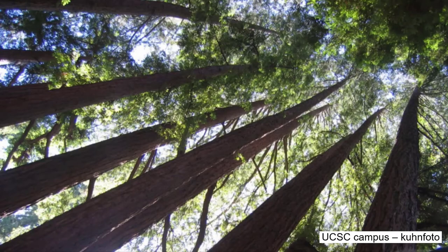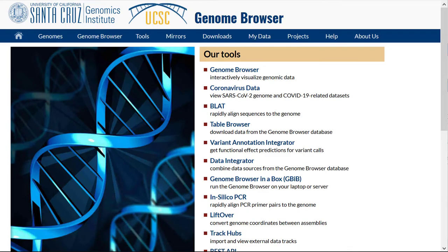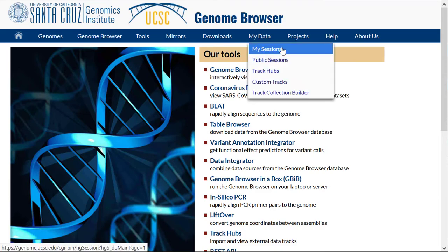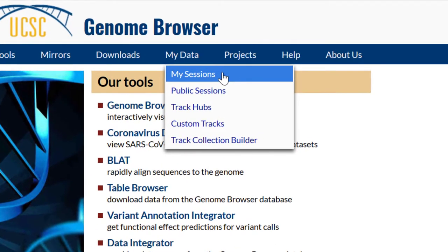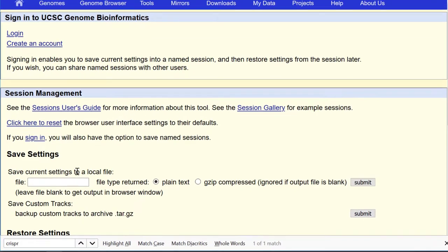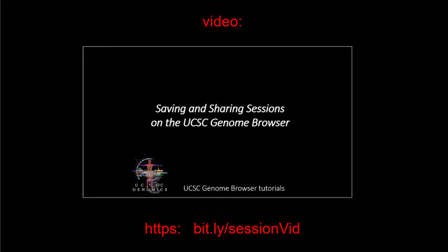An excellent way to save and share stable browser views that contain exactly what you wish to show is the saved sessions feature. Saved sessions require a login, and they create a semi-permanent link that we store in our database for future access. While we attempt to preserve your sessions and even back them up, you are encouraged to keep a local copy just in case. Hardware happens. The process for managing saved sessions is discussed in a previous tutorial in the UCSC video collection at bit.ly/sessionvid.